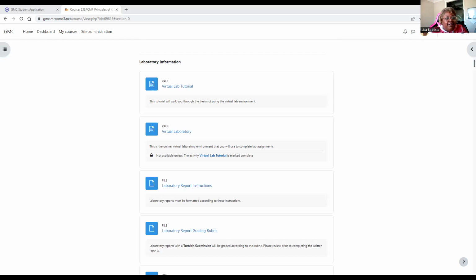And so you could kind of guess, okay, it's a little more than, it's about halfway between the 2 and the 4. So you could say it was 4.30, okay? The 4.3 would be known. That last zero is an unknown, kind of a guess. We saw when we poured it in that it told us it was 4.33, but say we forgot to write that down. So you would say maybe 4.30.